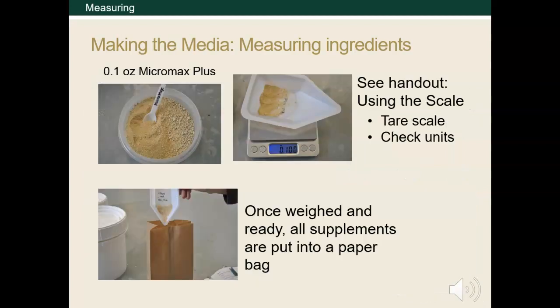Here are some images showing how to use the scale to measure the Micromax Plus. We only need 0.1 ounces. This is a small amount, so be sure to check your units. If you accidentally measured out 0.1 grams, you'd have only about 0.003 ounces. See the handout titled 'Using the Scale' found on Canvas. This handout covers how to operate a scale using a weigh boat, taring the scale, and then weighing your material. All of the additives, because they're such small amounts, are combined into a paper bag. This is the easiest way to mix them into the larger portions of the media.